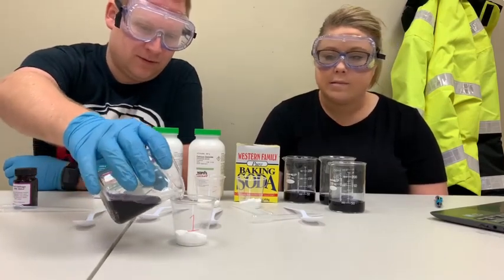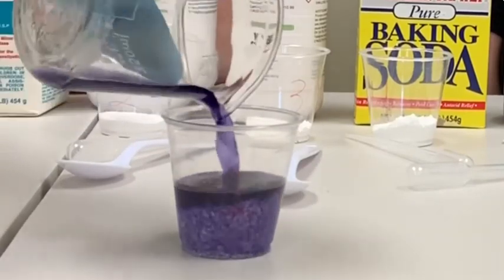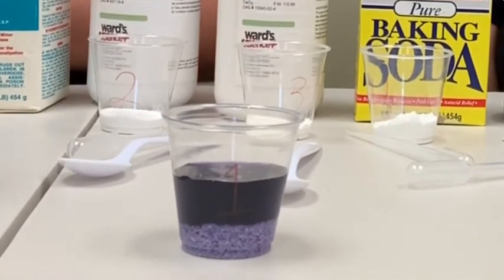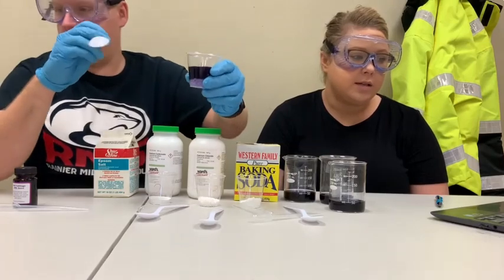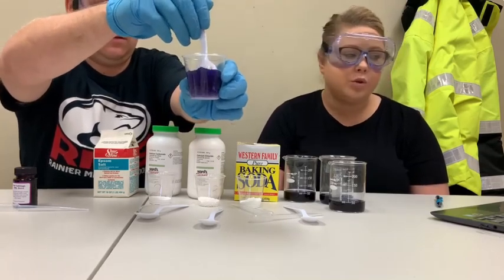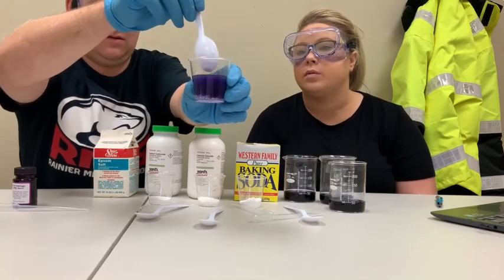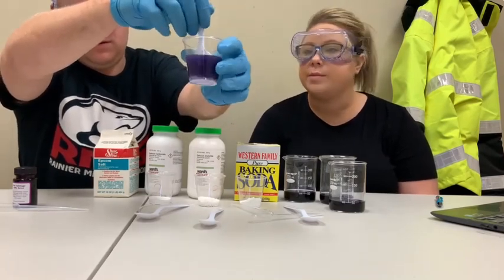All right, so here we go. The second step also says we need to make sure to touch the outside of the cup to observe any temperature changes. So this is adding the red cabbage juice solution to the magnesium sulfate. Do we feel any temperature changes, Mr. Olson?